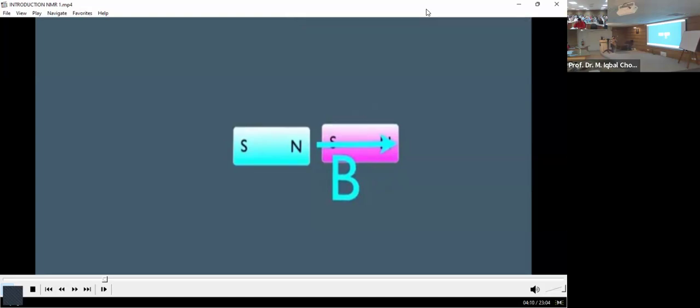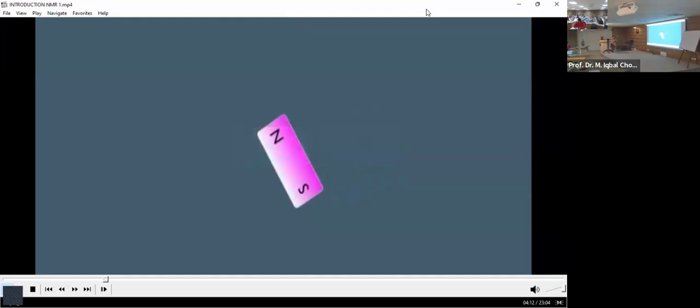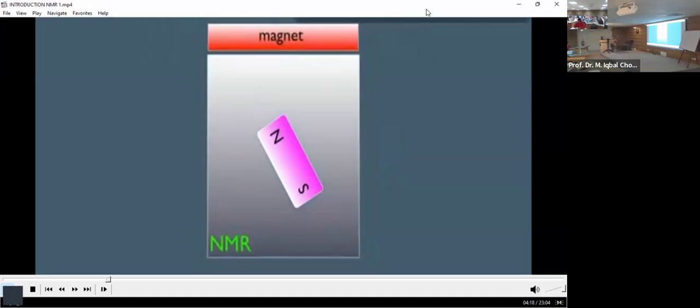So now let's talk about what happens when we stick these magnets in a machine such as the NMR. Let's say we're putting this in our NMR like this right here. And just think of the NMR as simply containing a chamber where a magnet or a sample could be inserted, and that chamber is being influenced by a big magnet here in red.